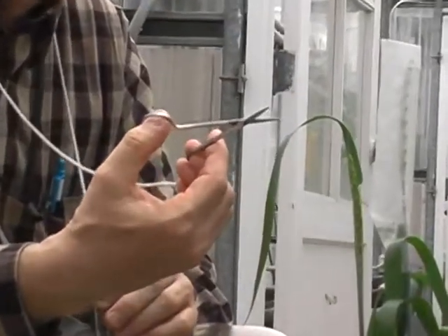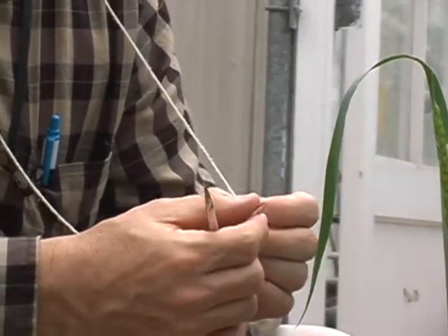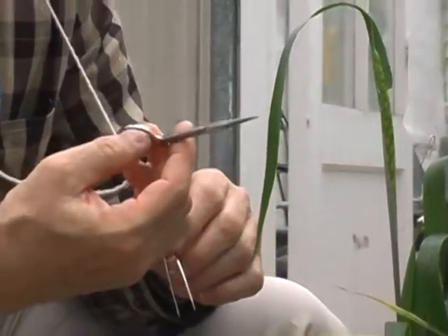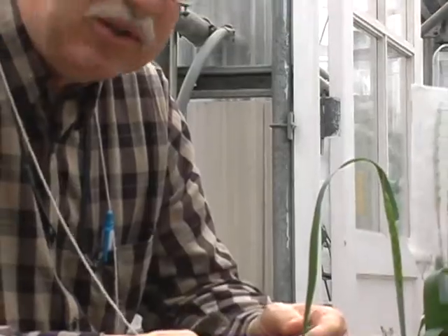I've had these scissors for probably an equal length of time. I've worn out the string, and you have to be very careful never to drop your tweezers — if you drop them, you'll break the points. These are all surgical grade because they last much better. We tried some that were iron and they rusted and were no good, so we use surgical grade scissors.